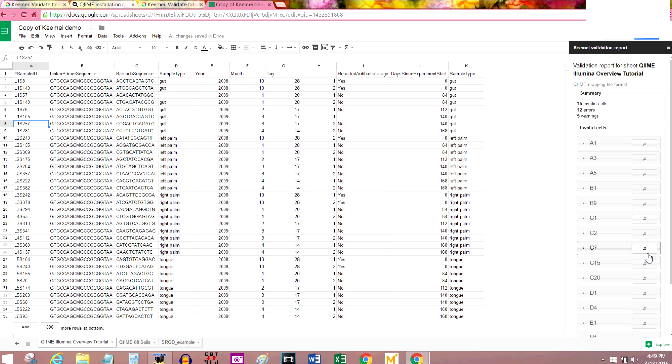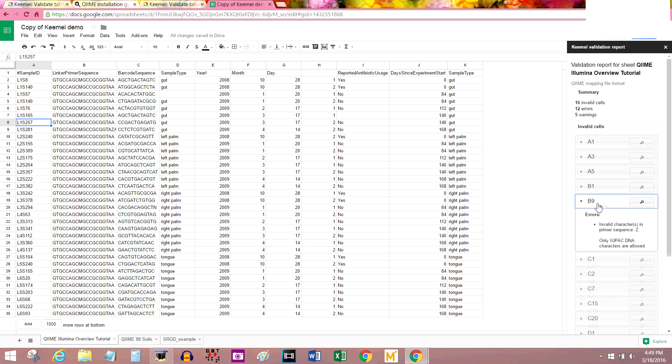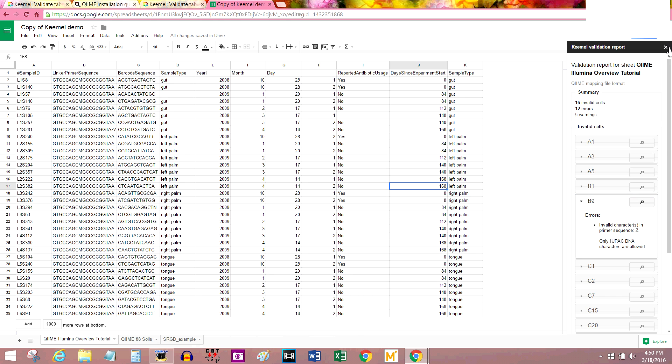The sidebar is still here. Especially for bigger files that take up more than the screen, the sidebar is pretty useful because it will find them and just list them all for you. And tell you exactly what's causing the error. I'll give you an example.